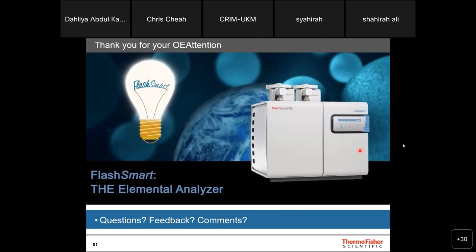Okay, if you don't have a liquid sampler, you can use the capsule, like I just showed in the video. And typically we will start with around 10 milligram.